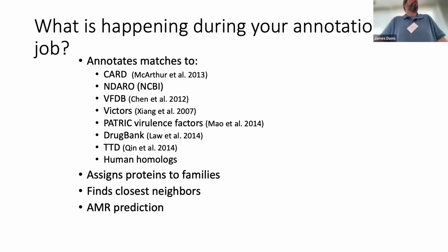And they're pretty trustworthy classifiers. It's a k-mer-based machine learning algorithm. So what it does is it finds the k-mers that are indicative of resistance only, and it maps those onto the genome as a feature.